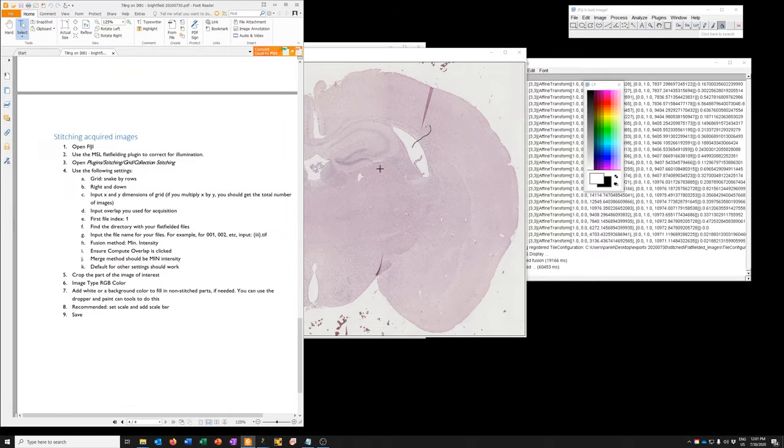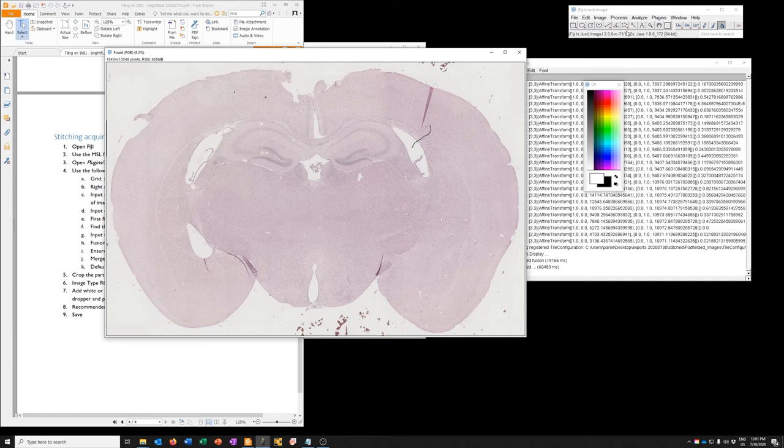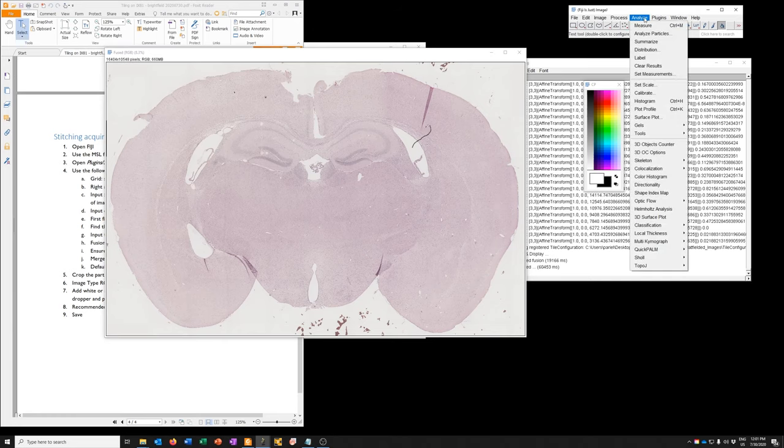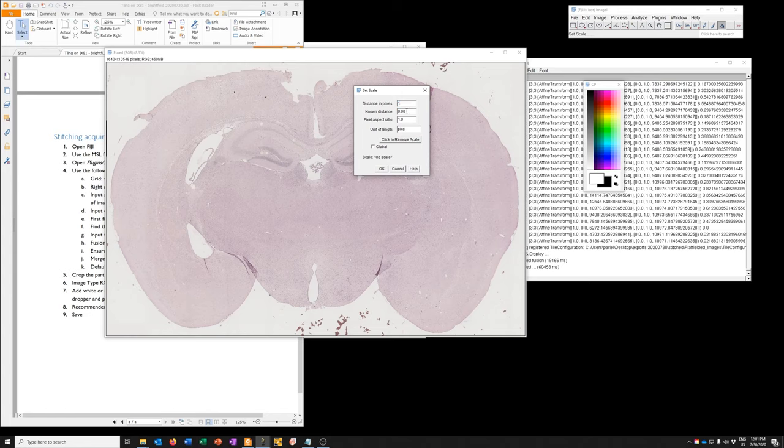Okay. Recommended. Set scale and add scale bar. So to set the scale, we can go to analyze, set scale. And here we need to tell it, okay, one pixel with the 10x objective using the bright field camera is 0.61. I got that off the table on the wall in the room with the iX81. And the unit of length is microns. Say okay.